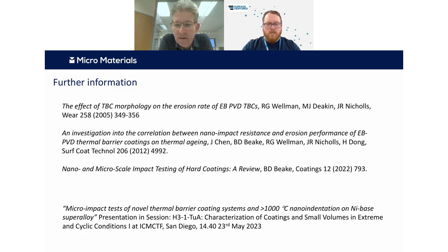But as I say, one of the advantages where we extended our test capability to go nano and micro was this ability to do these higher, blunter probes, but also allowed us to put more impact energy in, so we could accelerate higher force, but also to accelerate over a further distance as well, so much higher impact energies. Okay.